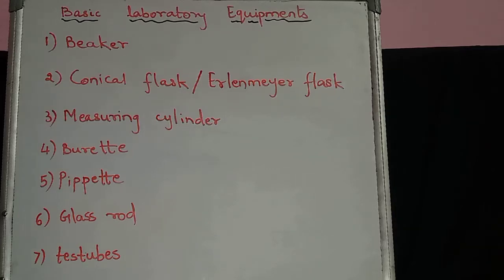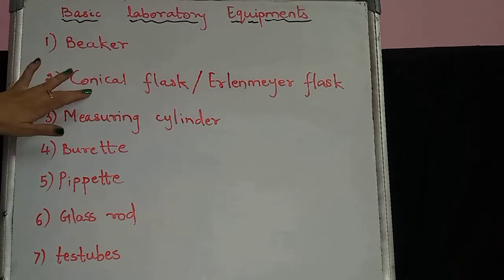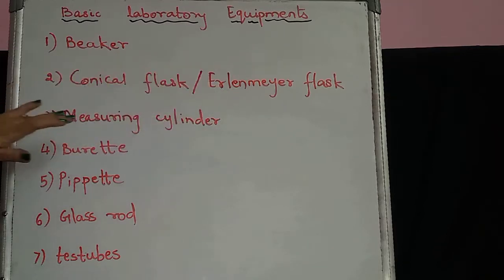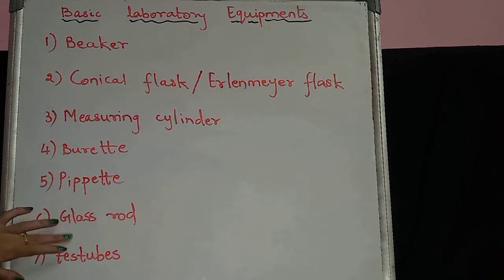Hello everyone, today I am going to show you some basic laboratory equipment. We use different apparatus in chemistry to perform chemical analysis: beaker, conical flask (also called Erlenmeyer flask), measuring cylinder, burette, pipette, glass rod, test tubes, and retort stand. So let's start.